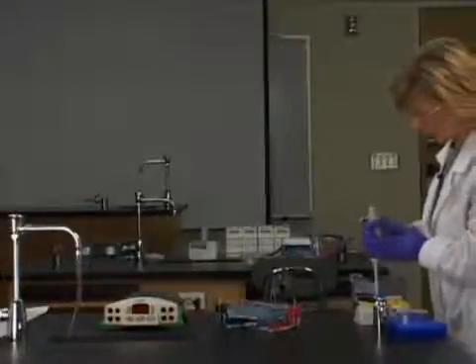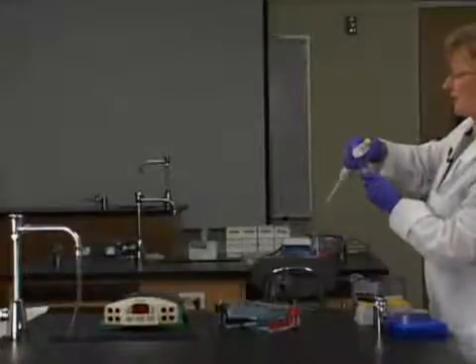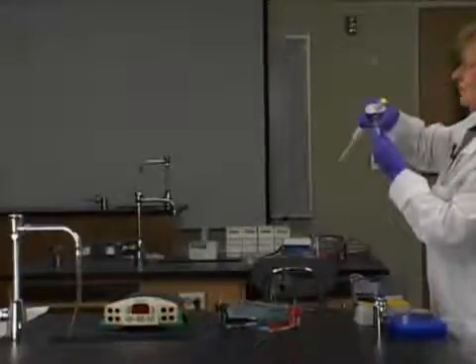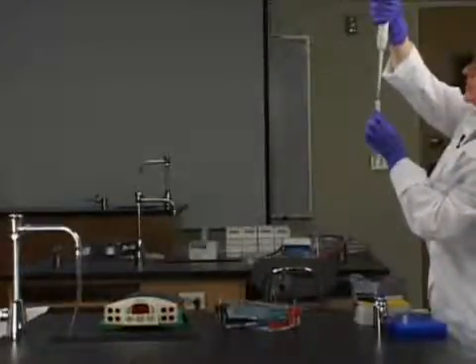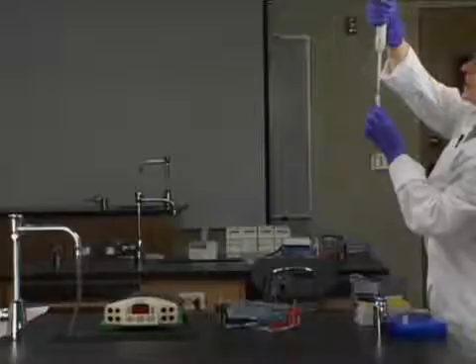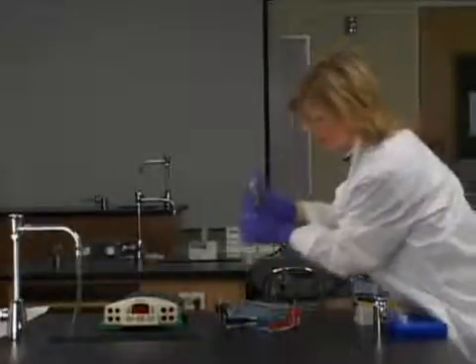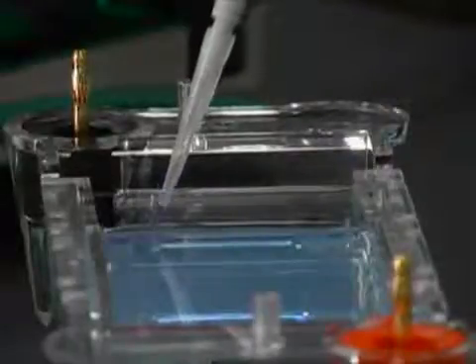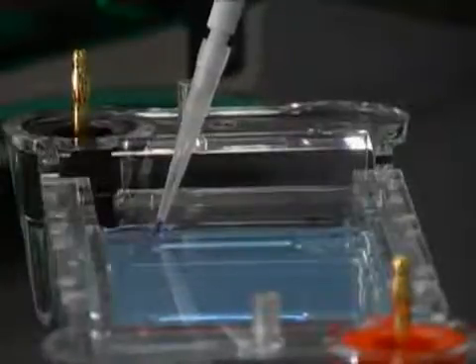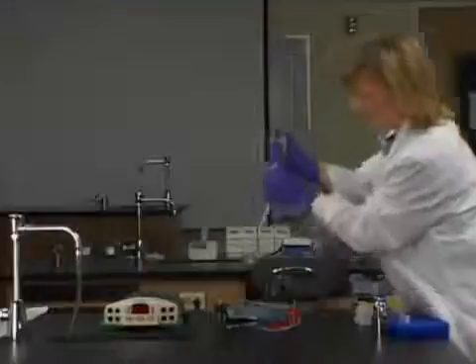And now we're going to get a fresh tip for every sample. This DNA was digested with only one enzyme. So we know where this enzyme cleaves the DNA. This enzyme is PstI. And we're going to load that into the second well. Slowly. There we go. Excellent.